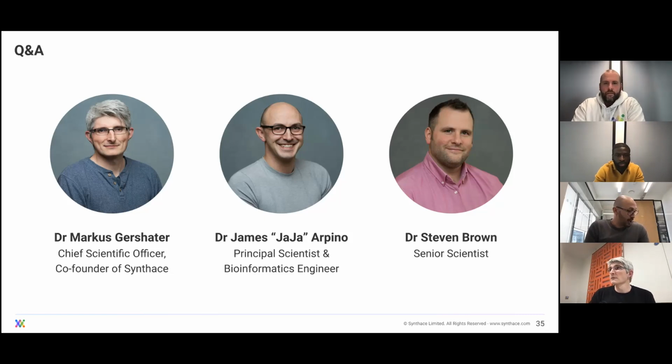That's a great question. No, currently JMP or any of the other statistical packages that are on the market and available to use, we don't embed them within the Synthace software platform. We have a file upload integration with those third-party statistical softwares. A lot of these softwares will export a DOE design in a simple tabular format as, let's say, an Excel file or a CSV file that can be uploaded into Synthace. We will then interpret that design file into the liquid handling instructions that you may need to execute that in the lab downstream. But we don't have a direct embedded integration with those third-party statistical softwares at the moment.